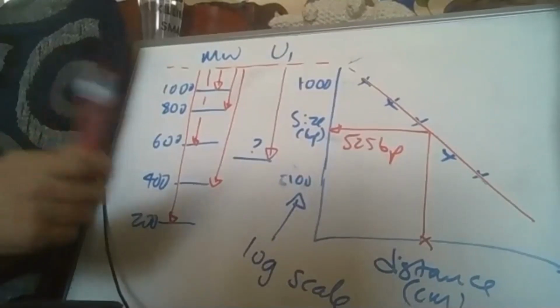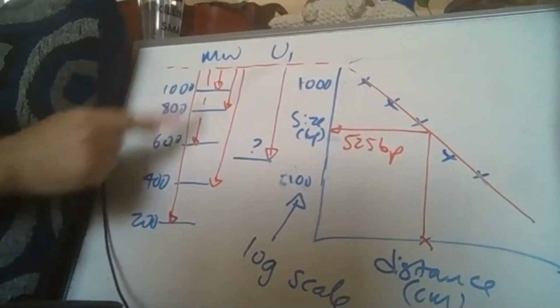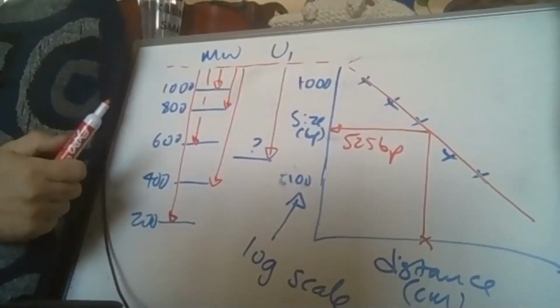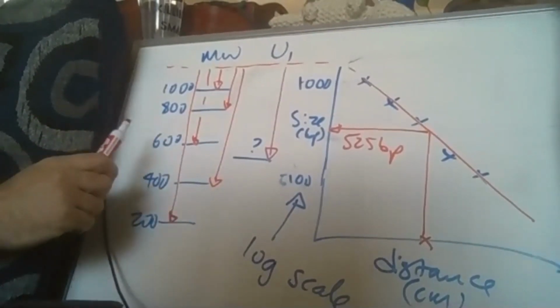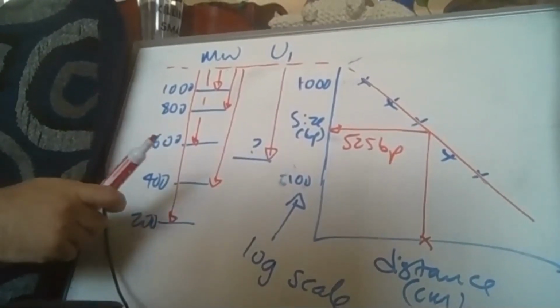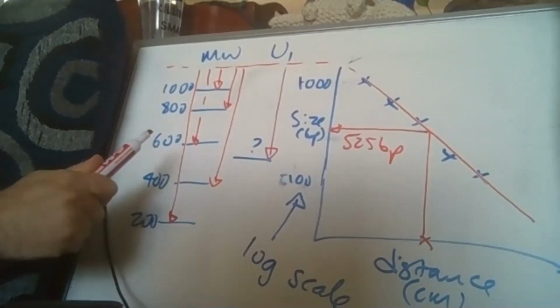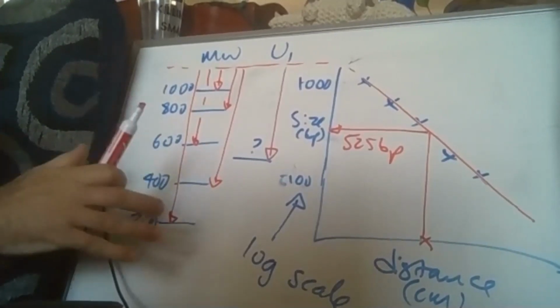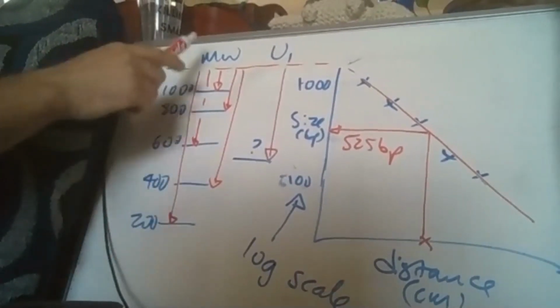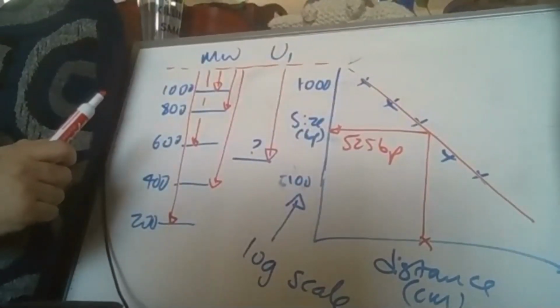So getting back to Rose's question, you have 2 different markers. You have the Promega marker, and then on the other side of the gel, you have what's called the Edvotech marker. Names aren't really that important. They differ in the number. Serena said there's 13 in the Promega one. I think there's 5 in the Edvotech one, right? But you need to draw 2 different graphs, one for each of those markers, one for the Promega one, and then you do the same for the Edvotech one.